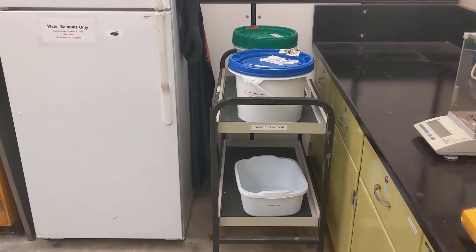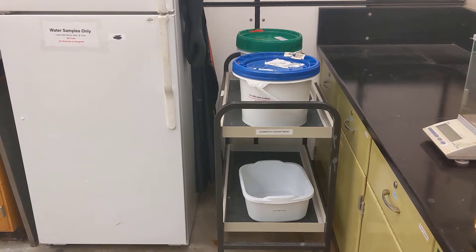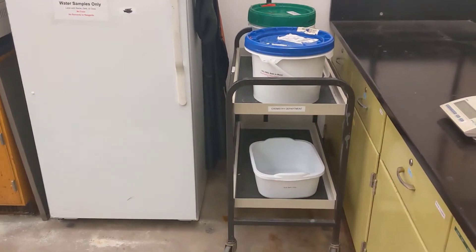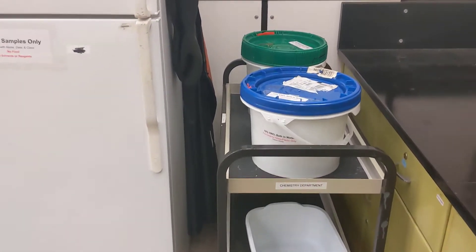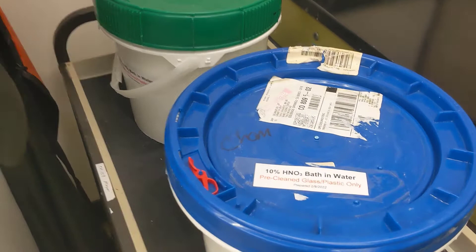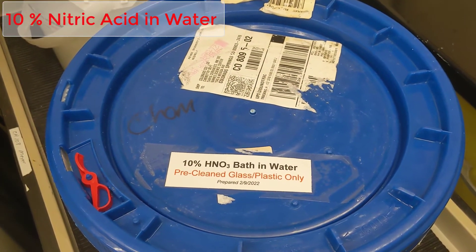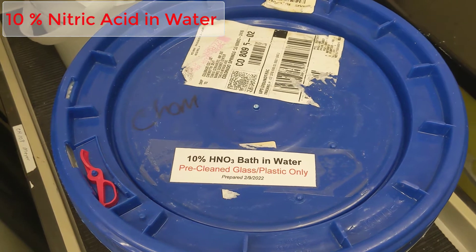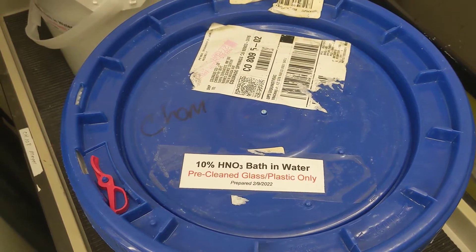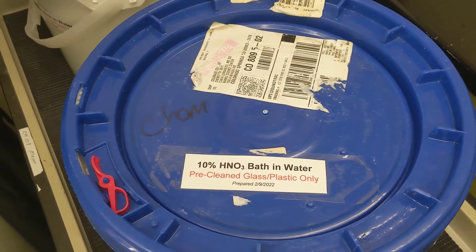This video is a quick tutorial on how to safely use the acid cleaning and rinsing bath in the analytical laboratory. The baths are in these three-gallon chemical-proof buckets here, labeled 10% by volume nitric bath and water. Anything that goes in to be cleaned must be pre-cleaned with soap and water and then triple DI rinsed, so that you're not adding soap to the system.